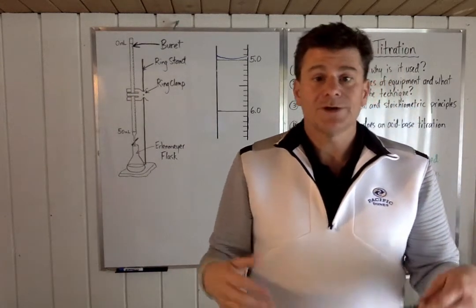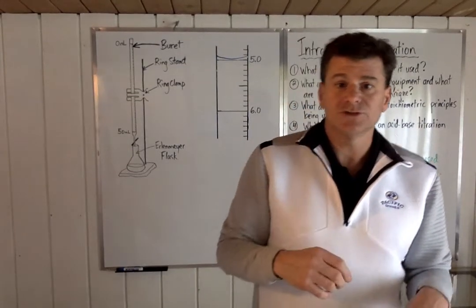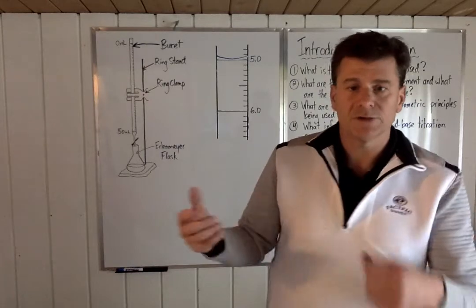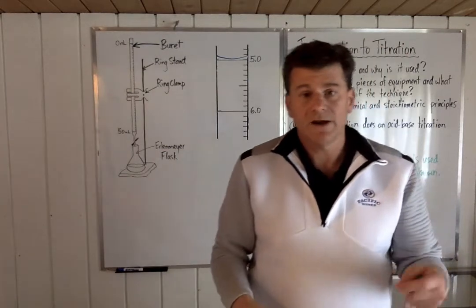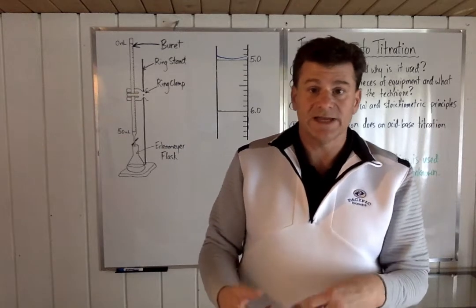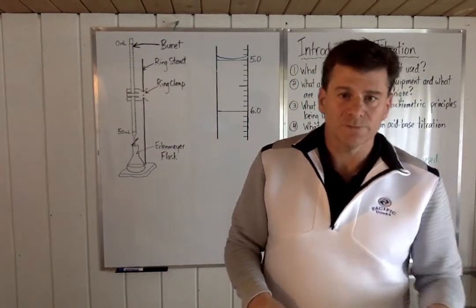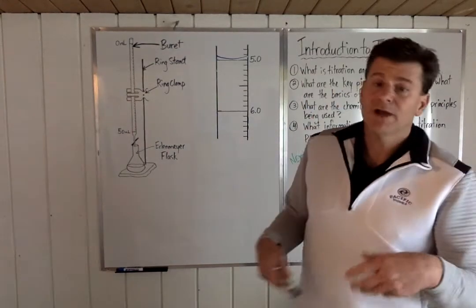The other thing is when you're first setting up, you always have to rinse the burette one time with a little bit of whatever solution you were going to pour in there, to get rid of the excess water and stuff that you used to rinse the thing out before you got going. So if I'm going to pour some base up into here, I would rinse with maybe 5-10 milliliters of base, and I would pour it out into a waste container. Just rinse out any of the other solutions that might have gone through there previously, probably water, because you were probably rinsing it before you got going. Okay, so that's that. The burette, also reading it.